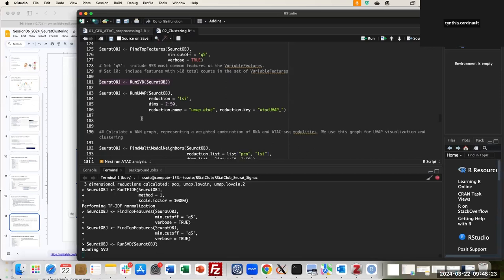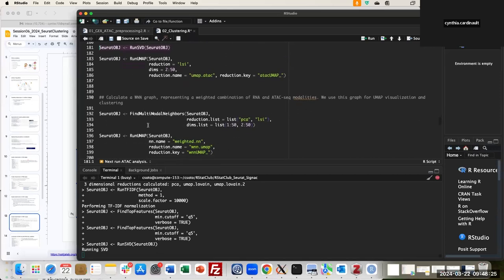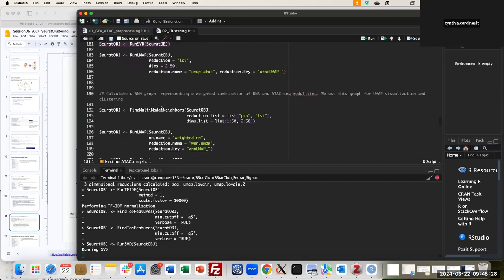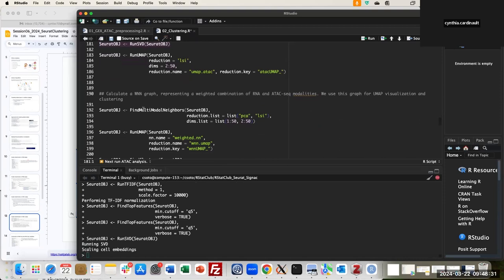The next steps are very similar to what we ran for gene expression: we find multimodal neighbors, but here we are combining the two reductions. We have PCA for gene expression and LSI for ATAC, and I specify the number of dimensions — dimensions 1 to 50 for expression and dimensions 2 to 50 for LSI, since we skip the first dimension.